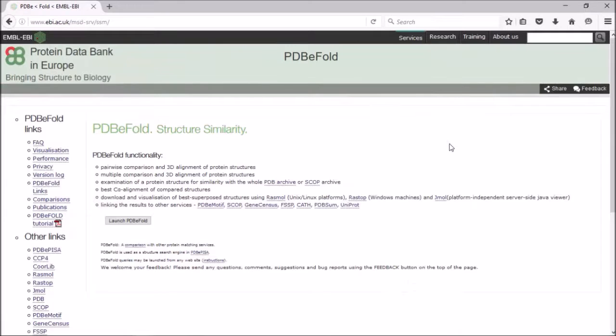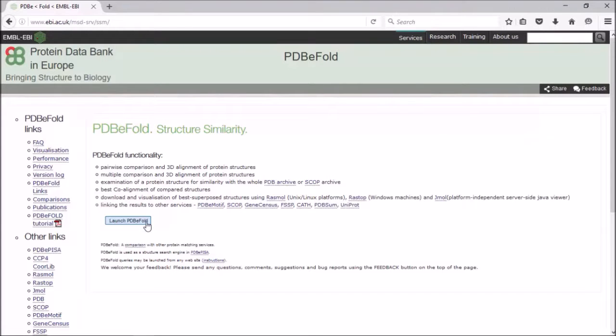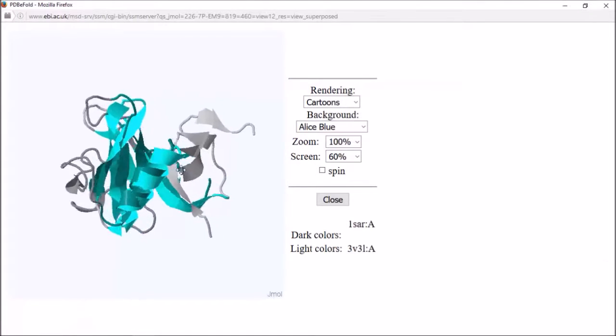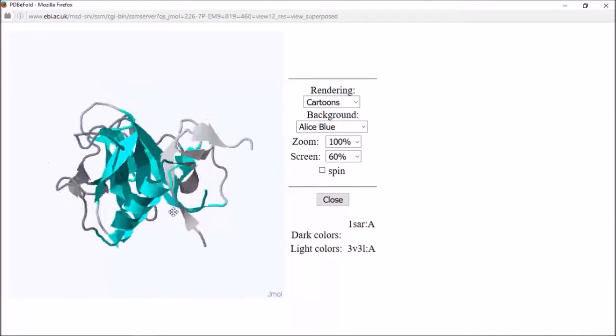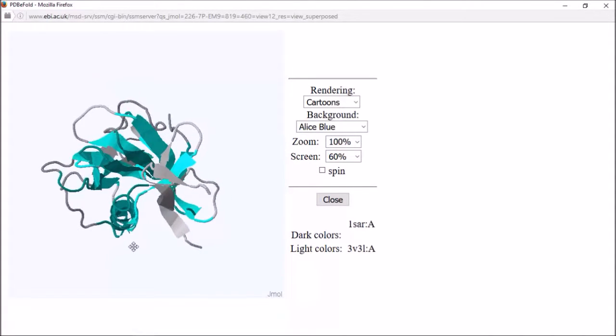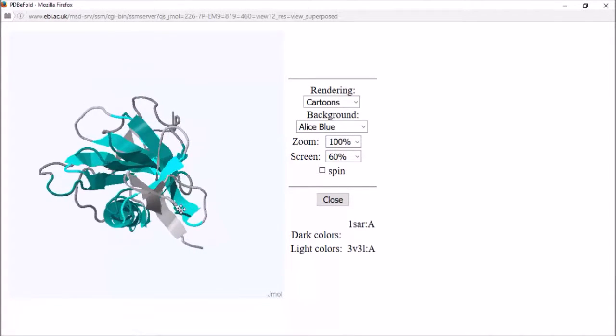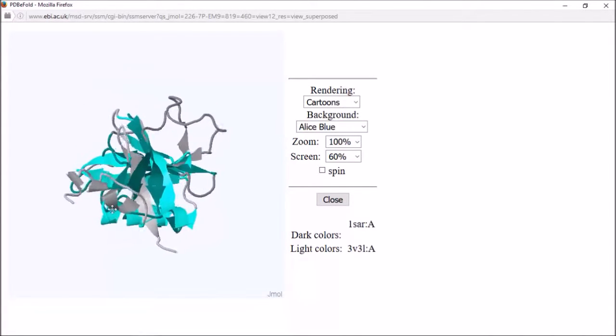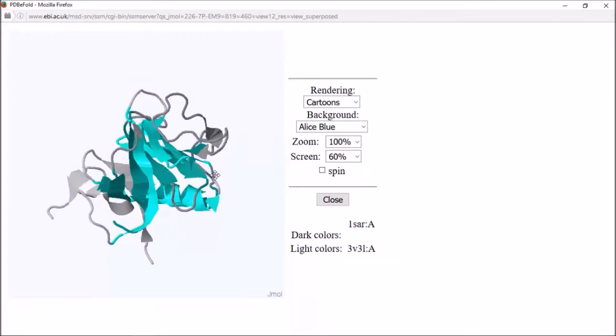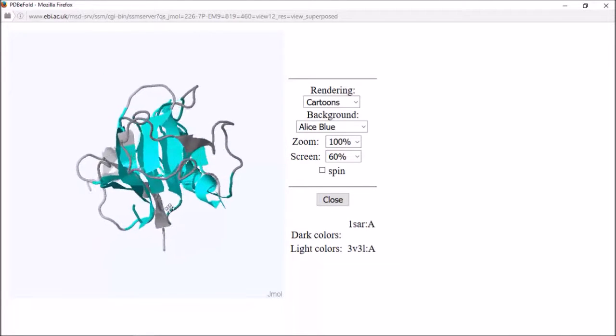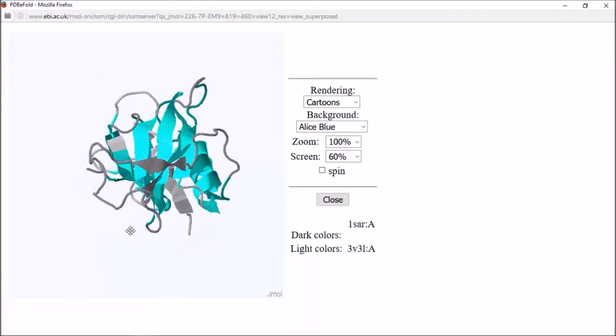There is a launch button here to launch the service, and you can find any structurally similar proteins to yours of interest. You've then got the ability to view the superimposed structures and see where these similarities are on the structure, and maybe where any differences are as well within these structures.